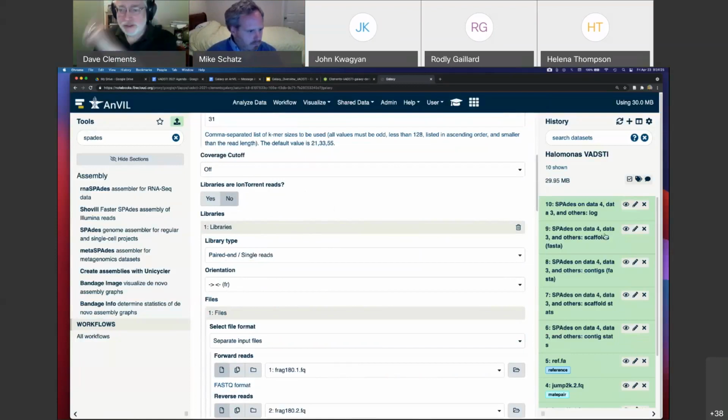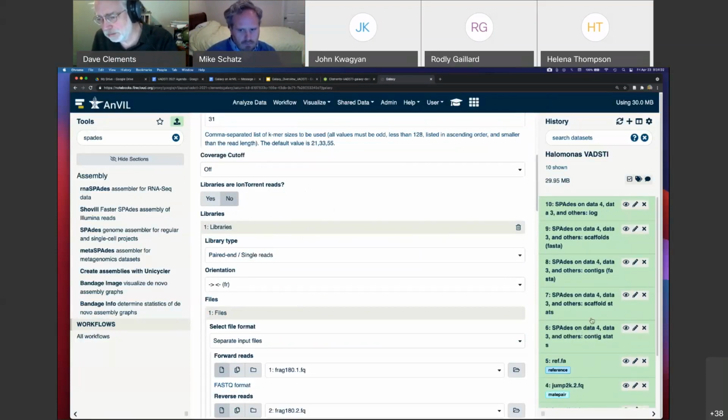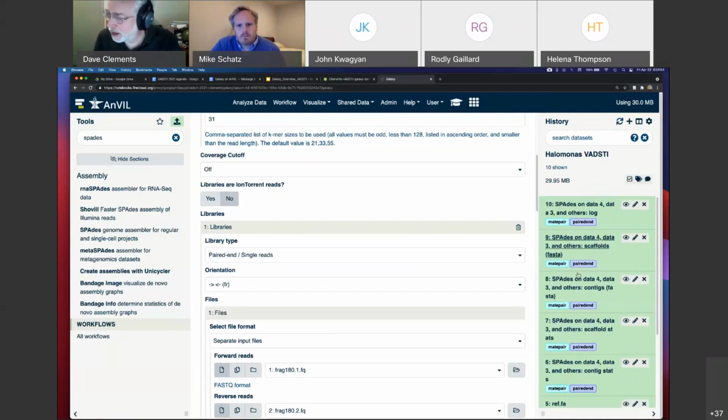so the second bug, and I think the last bug of the day, is note that I put tags on these, and I said they would percolate up, but we don't see them. And that's because of a bug. So I'm going to click refresh history. And now we see them. So we're going to click that a lot as we go. And what this tells us is that the Spades output here was built from these data sets. Okay? And again, it tries to help us keep track of what's what. And as we get more and more data sets over here, these become even more important.